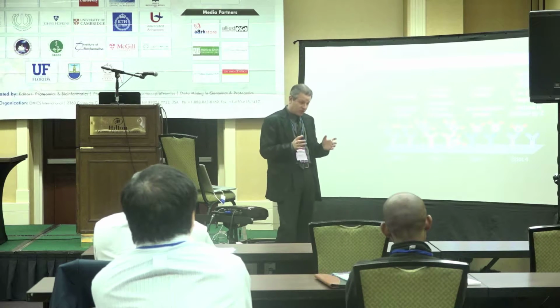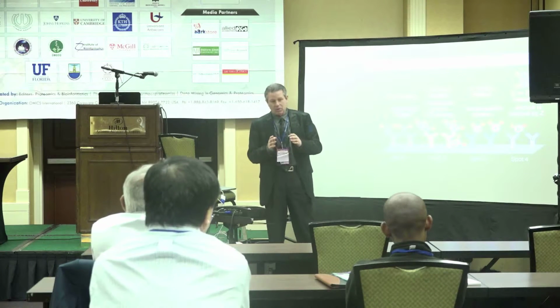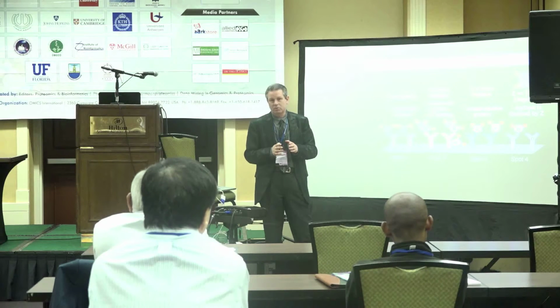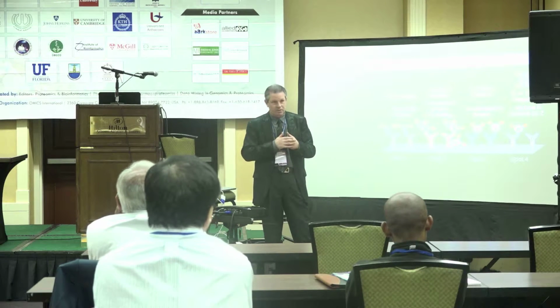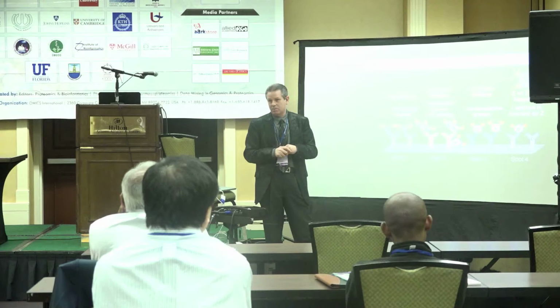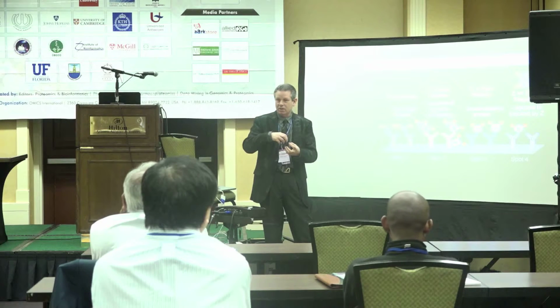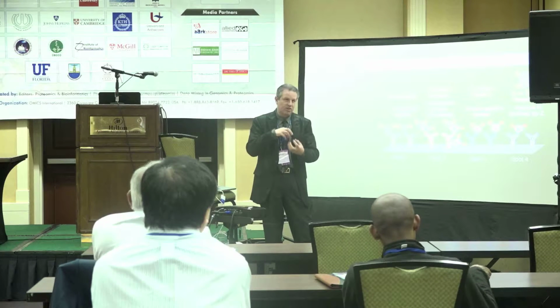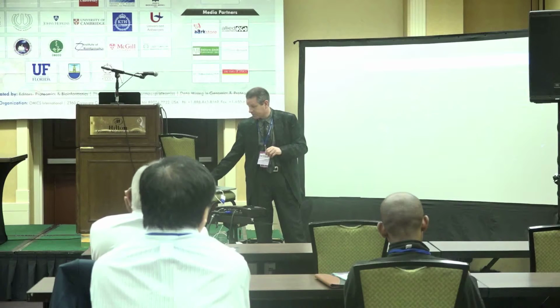It's another major issue, it's a two-edged sword. The antibody microarrays, based on the data that we have, are, I would say, at least 50 to 100 times more sensitive than Western blotting. So often we can see a lot of results in the microarray, and we cannot see any bands on Western blots. And it makes sense because you're really concentrating the antibody and you're concentrating the antigen. And so you can see those interactions that you just cannot see by Western blotting. So it means it's hard to validate the results sometimes by Western blotting.